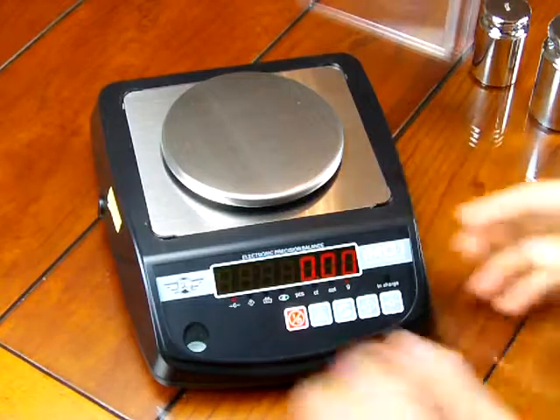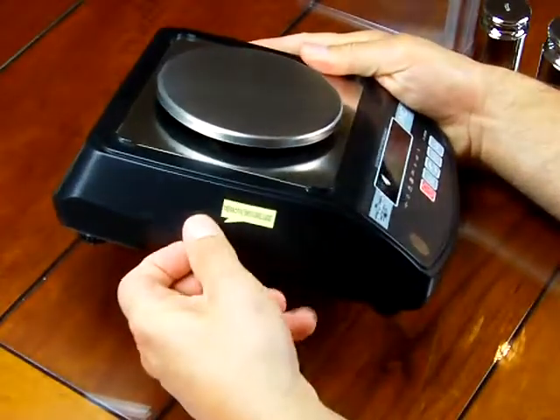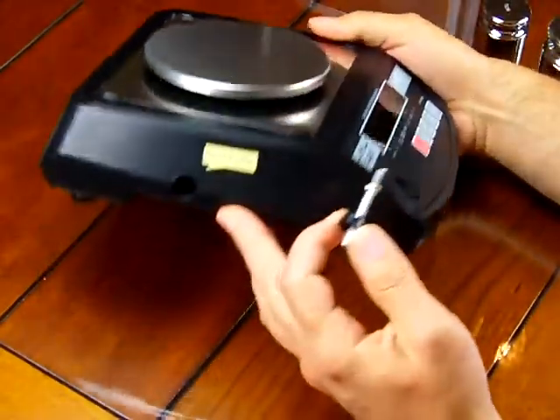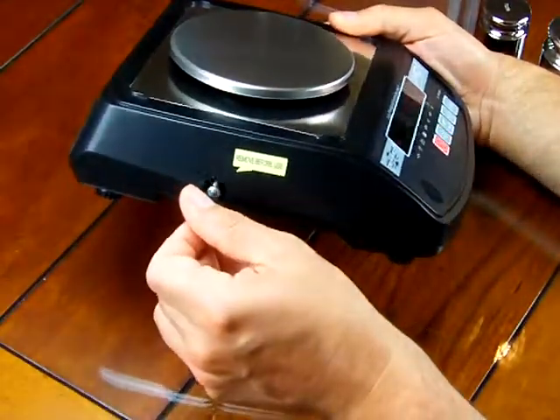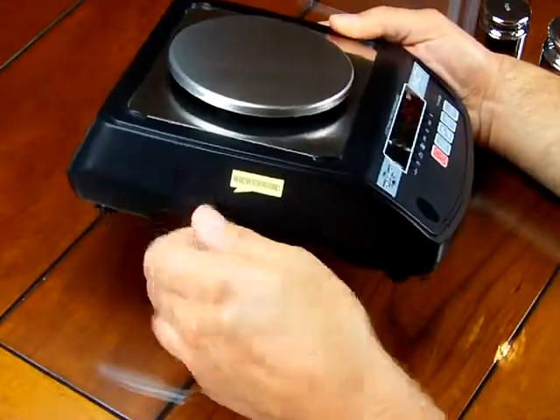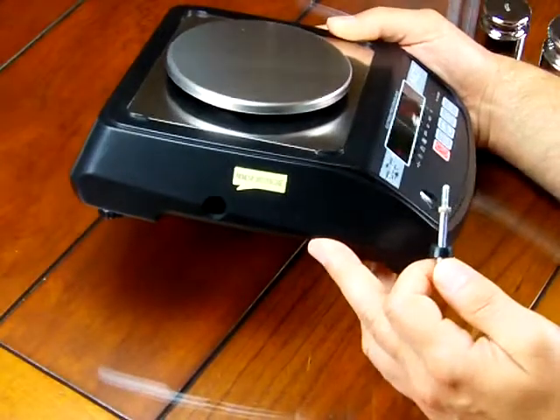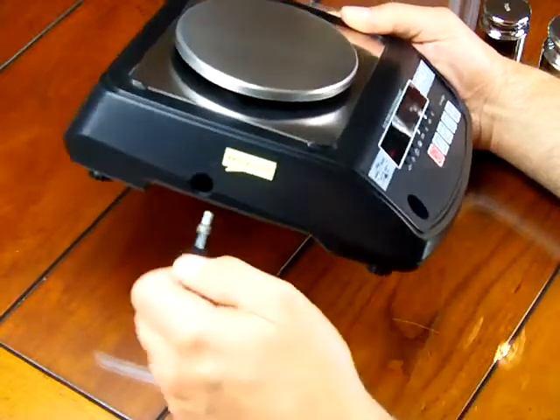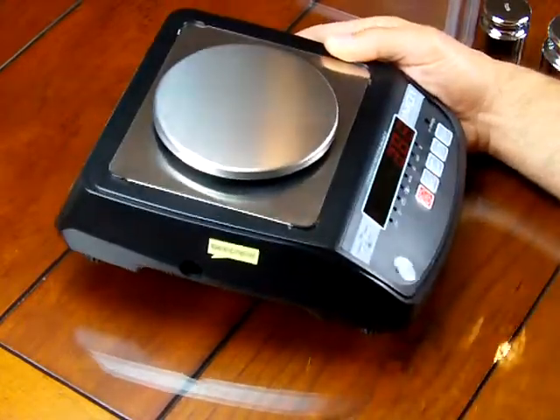The scale also has a really unique feature: on this side of the scale, when delivered, there's a pin that locks the load cell in. There's a little port right here, and it's basically just a bolt that's threaded — you just turn it in and it locks the load cell. When you buy this scale, you have to unscrew it. If you're a school and only using this scale for a science project, when you're done and not going to use the scale for a while, we recommend using this pin — it prevents the load cell from getting damaged. It's a great little feature.